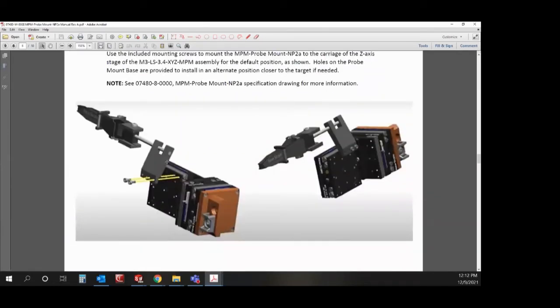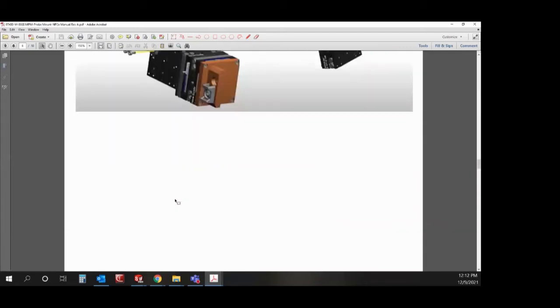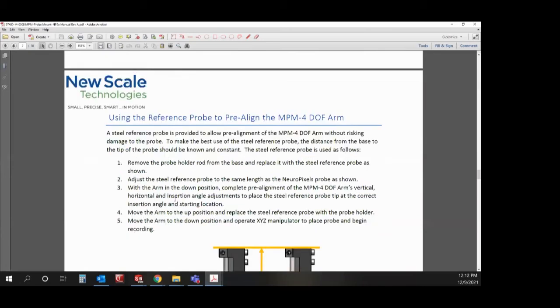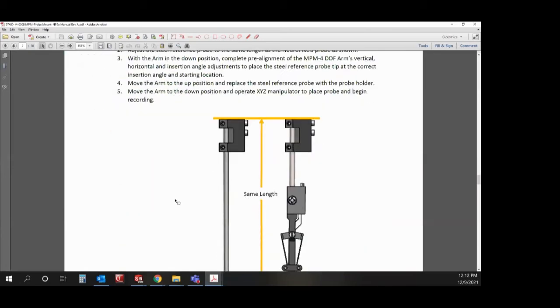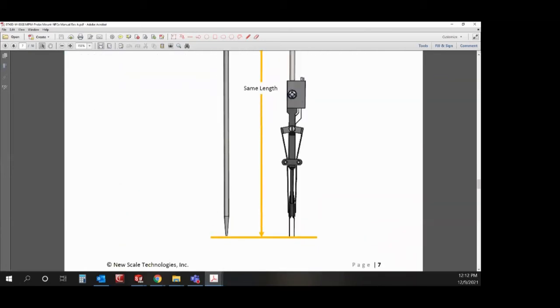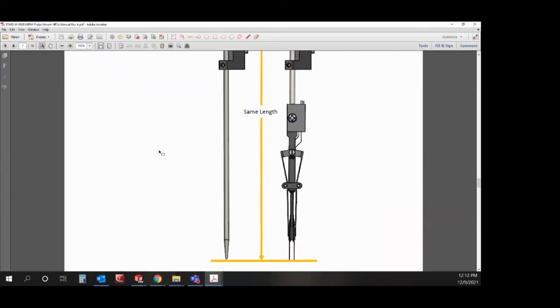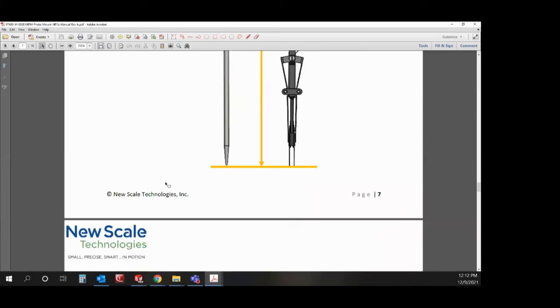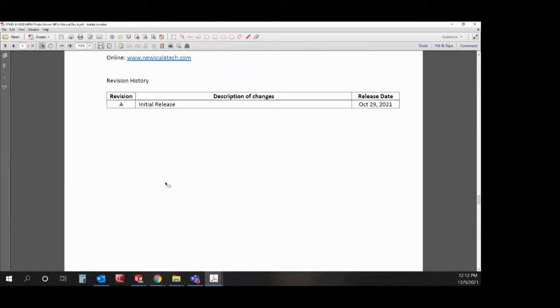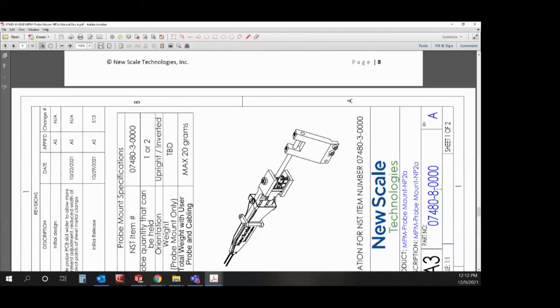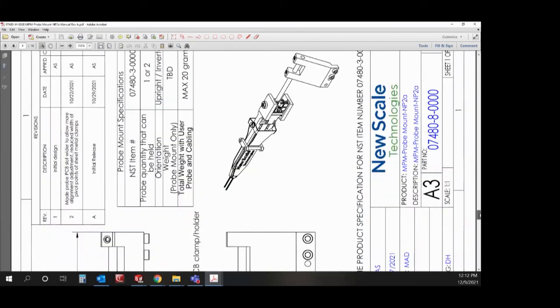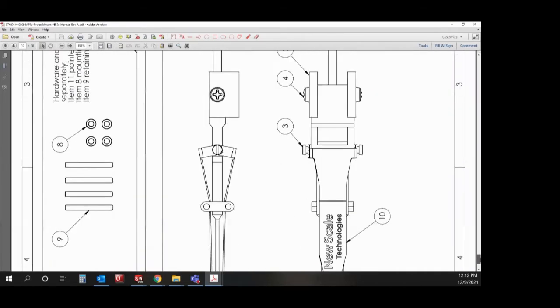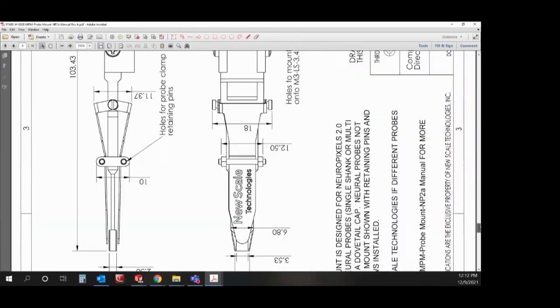Fully rotatable, 360 degrees for more options of fitting as many probes as possible in a tight space. We also include a pointed calibration rod so that you can pre-aim your fixtures without risking damage to the probes themselves. Get everything set up so that you're pointing right where you want to be. At the end of our document is our specification drawings and these are available on our website.